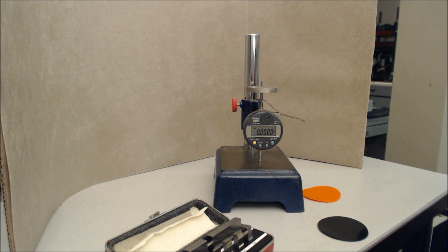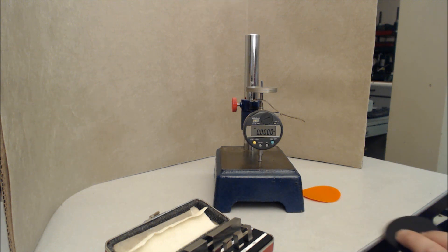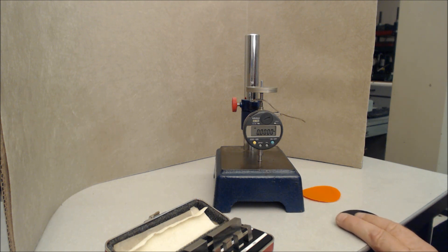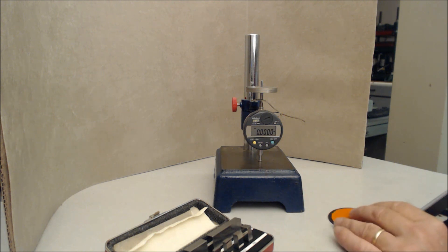ASTM D5199. You'd have to run 10 specimens and give the average of the 10 specimens to comply with the specification value in GM-13. Thank you very much.